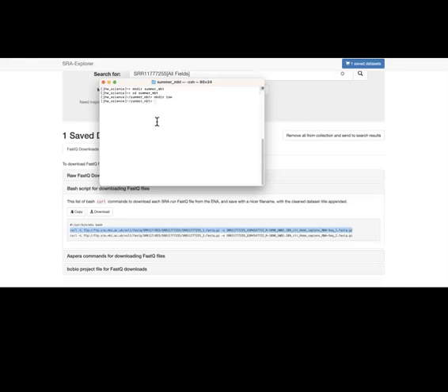So I recommend that you organize your directory in a way that you can keep the original file separate from the files that you will be working with. This is not as important here because we can always re-download the file again if needed. But imagine if these were your raw data that you got from the sequencer.